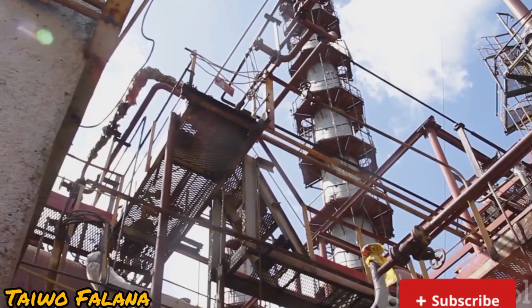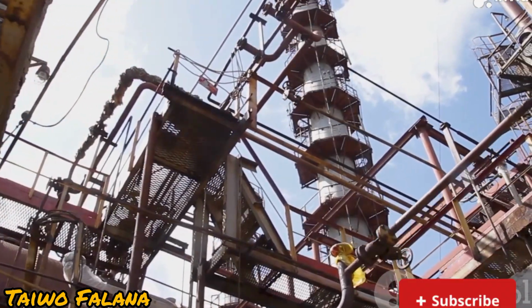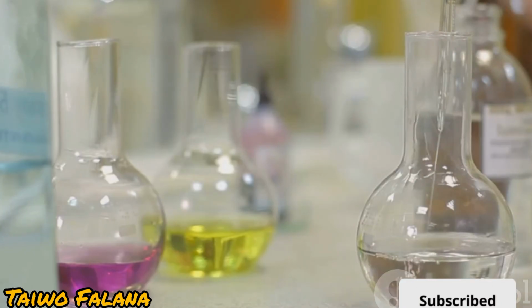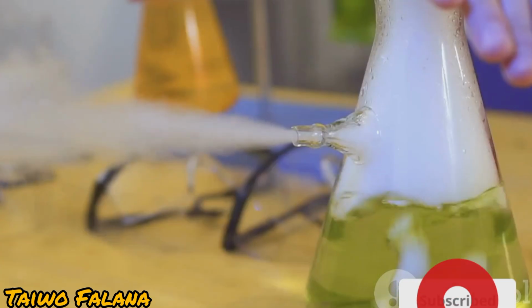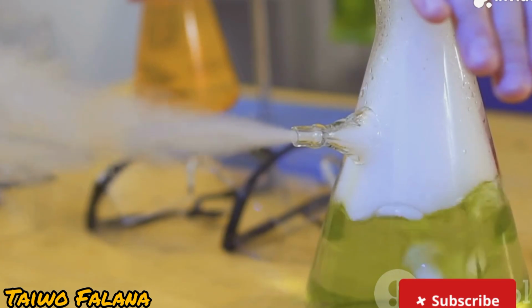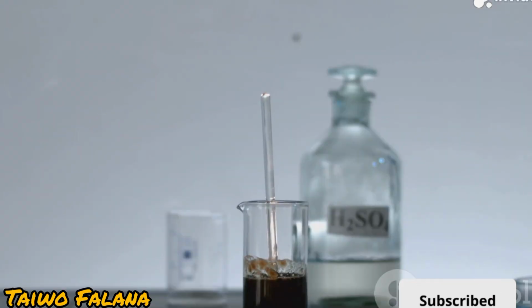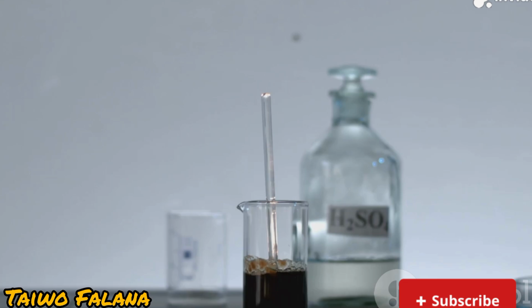CO is useful industrially, in making chemicals like methanol, and as a reducing agent in metallurgy. But in real life you definitely want to avoid breathing it in. How do you tell CO₂ and CO apart? Easy. Bubble both gases through lime water. CO₂ gives a white precipitate. CO does nothing. Remember, always know your safety rules, your chemical equations, and the real-life uses for what you learn.